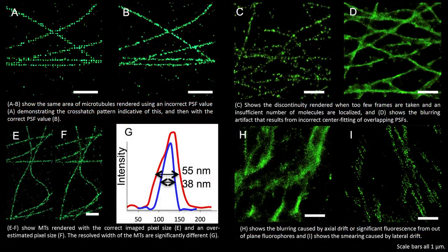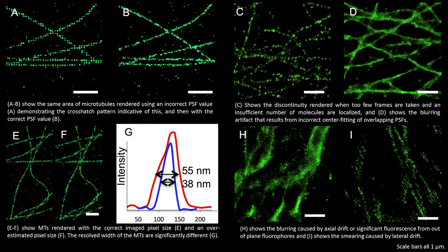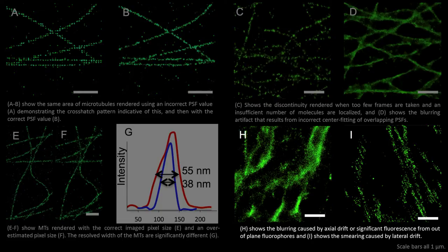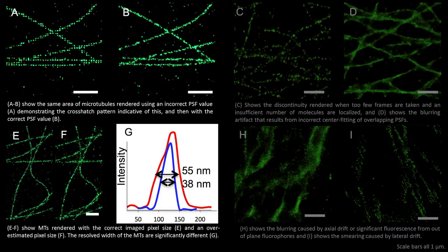In the article we also discuss several different kinds of sample measurement and rendering based artifacts and show how they can be detected using a known structure such as microtubules. For example axial and lateral drift artifacts and the errors caused by inputting an incorrect point spread function or pixel size.